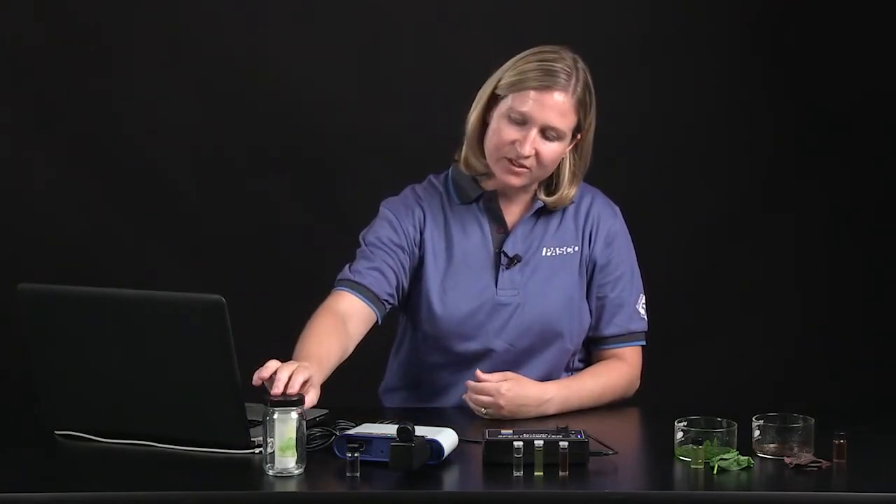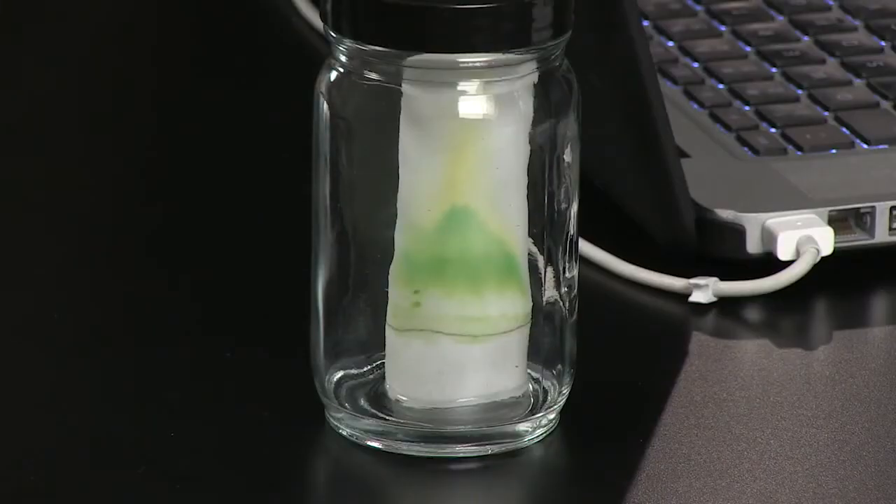A lot of biology teachers in their classroom already do a great activity with their students, which is to separate the pigments from green spinach leaves into the different pigments actually in the leaves using paper chromatography. This allows students to see that yes, there is a green pigment in the spinach leaves, but there are also other colors — yellow and orange pigments as well. The colorimeter and spectrometer allow students to gather additional data that make the activity a little more meaningful for them.